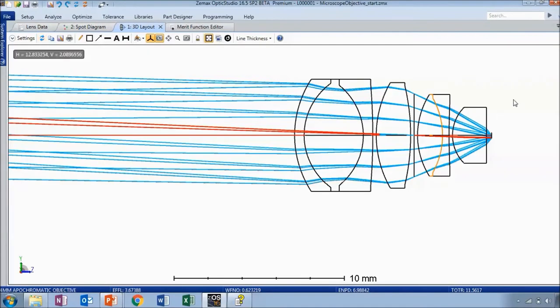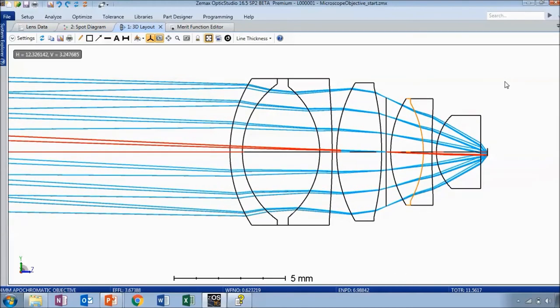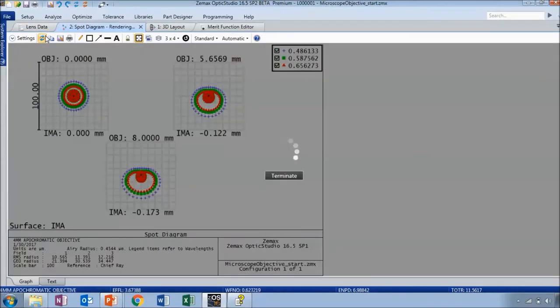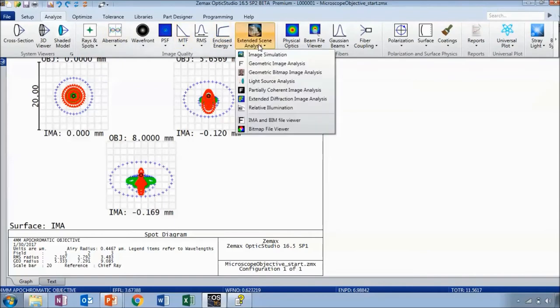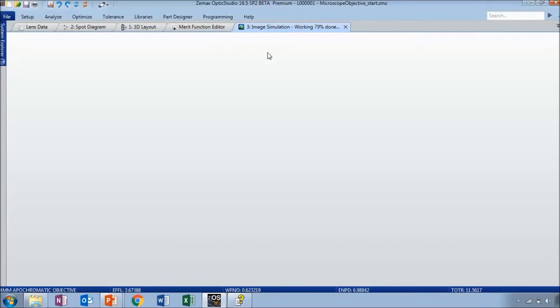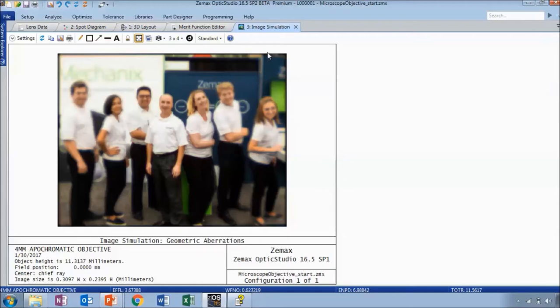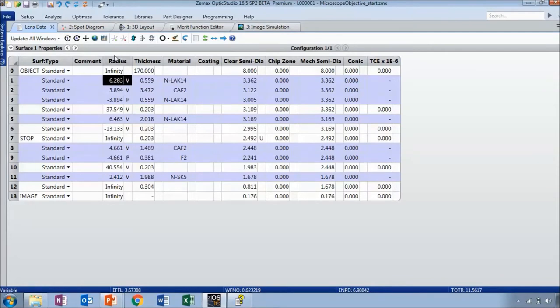Let's exit and see how our system has changed. Updating the 3D layout, the shape of the lenses has changed a bit but overall the system doesn't look too drastically different — also in part because I didn't set any thicknesses to be variable. Updating the spot diagram, the scale changed significantly — we're now down to a 20 micron scale, so the spots have become much better. We can also open up the image simulation tool again to see how that improved, and already it looks much better.